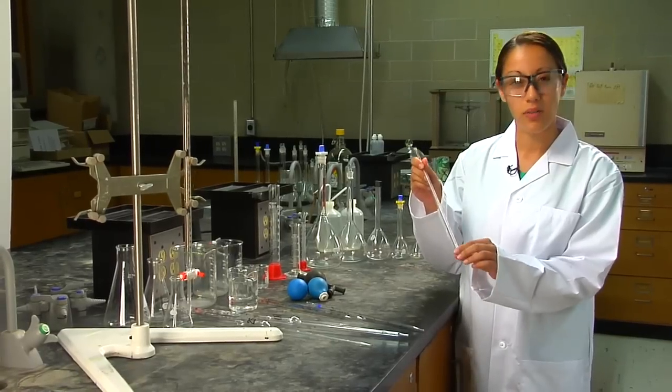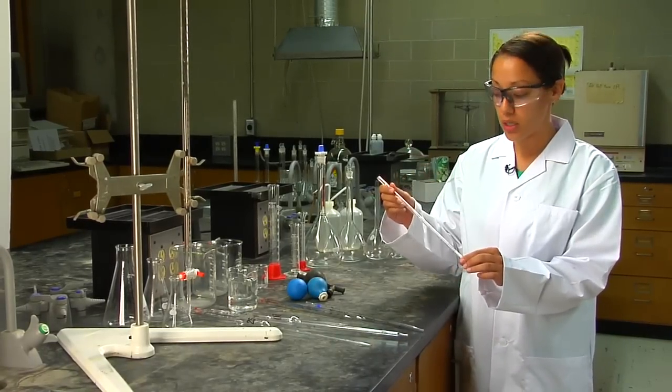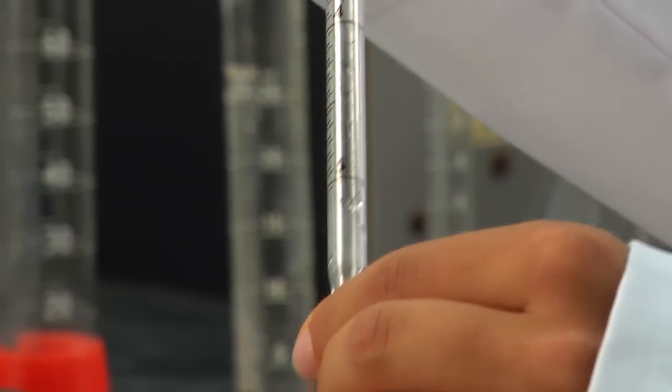With a Mohr pipette you need a special bulb, but you won't be using this in this lab. It's good to know what glassware is out there.